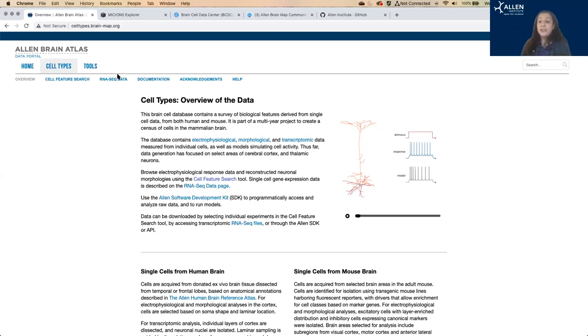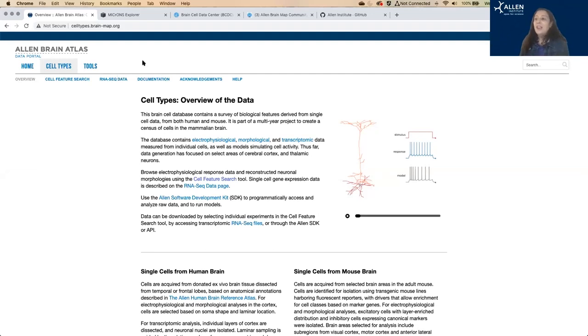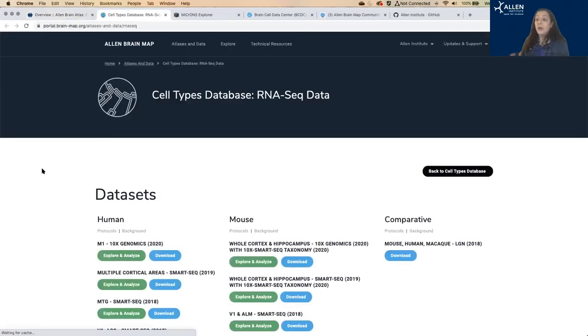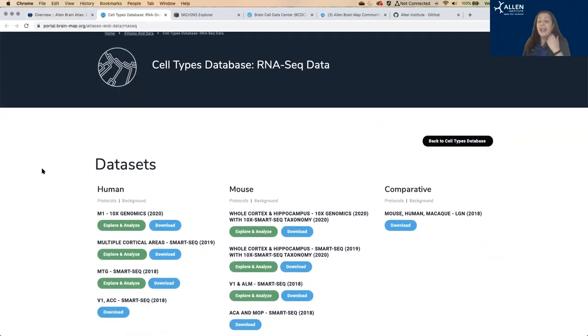Most of our data to date has been divided into two streams. The ephys and morphology go one way, and the transcriptomics go the other way. So I'm going to start with the transcriptomics. This is the bulk of our focus and also the larger fraction of our data. We have tens of thousands of individual cells here.